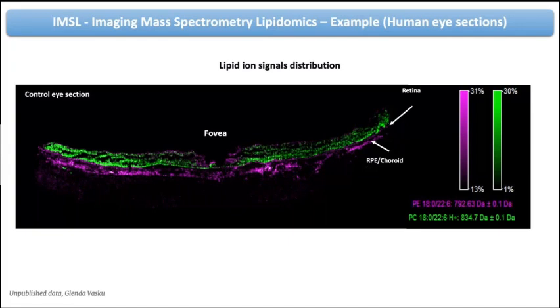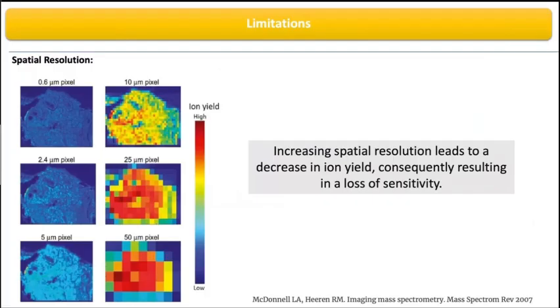So even a slight difference in their structure, like the polar head, would make these lipids have a different spatial distribution in this tissue. So this is very important when we want to, for instance, compare control with disease groups, or when we only want to have simple information about the distribution of these lipids in this kind of tissues.